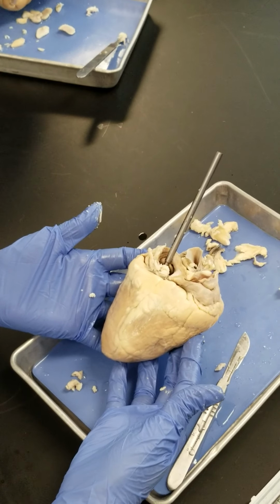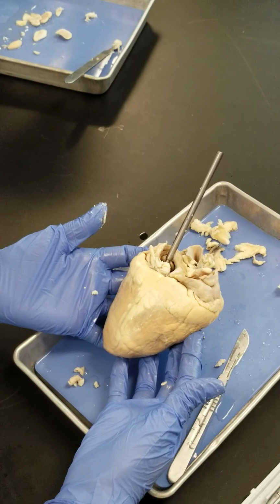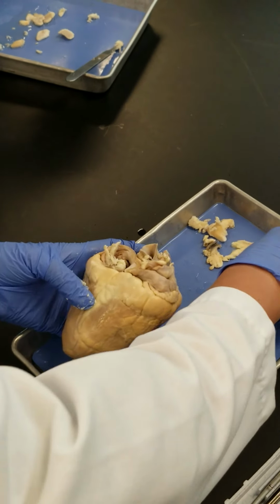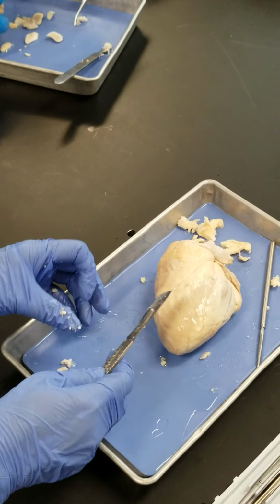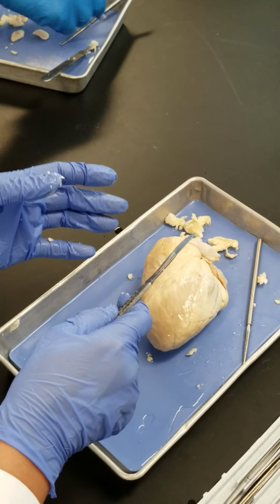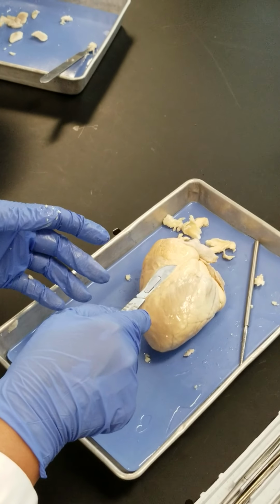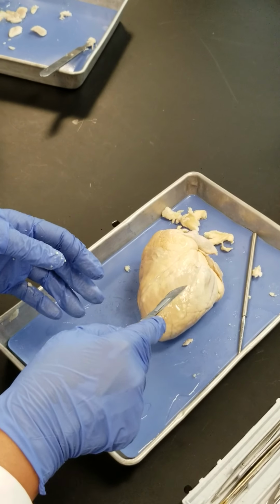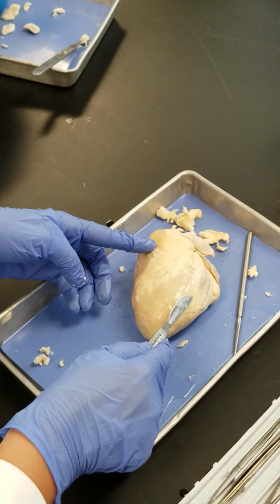Okay. So that was all the things about the outside of the heart. Now we want to dissect it and see the inside of the heart. Good? Okay. So you go toward the anterior side. You want to find the border between the ventricles, right? So what should we search for? The anterior interventricular sulcus, right? So this is the border between the left ventricle and the right ventricle, right?